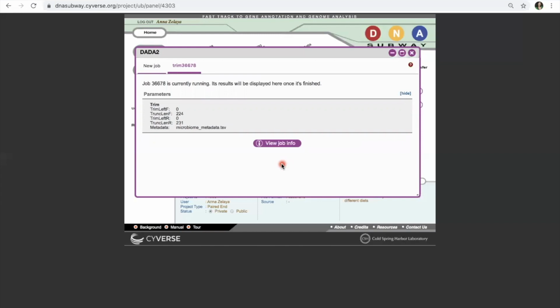So what I would recommend is, after you start this step, go ahead and close your browser and work on other things. Maybe don't check on it until the following day. If you start it at the beginning of the day, check it mid-afternoon or even nighttime. If it's at night when you start it, check it in the morning. But just give it some time to run, especially if your entire class is going to be working on this at the same time. It is likely that it will take a long time. So just check on it every now and then, but don't be surprised if it takes a long time.